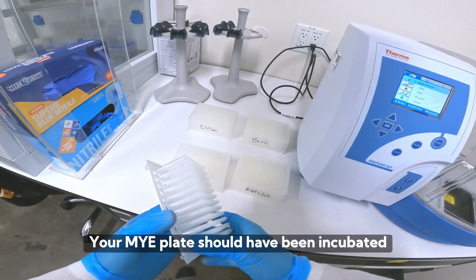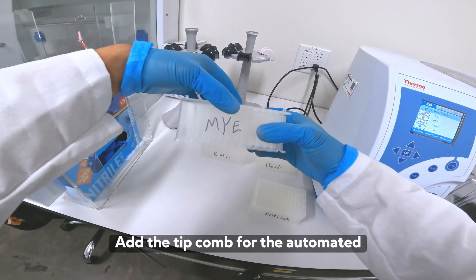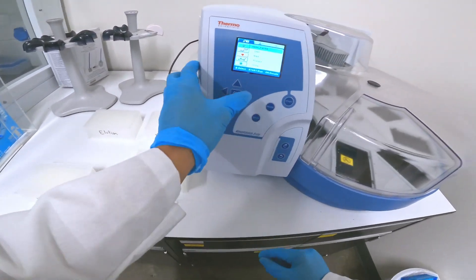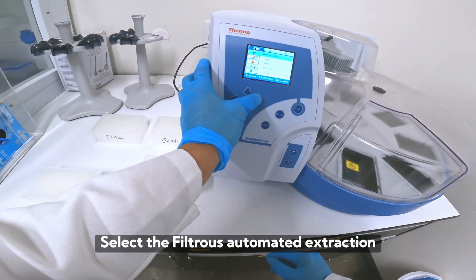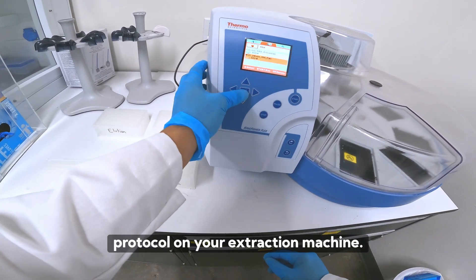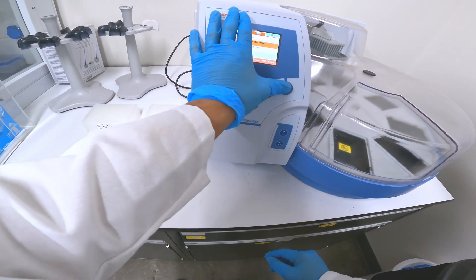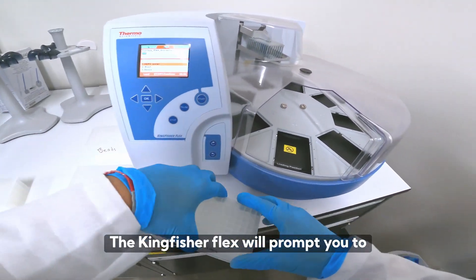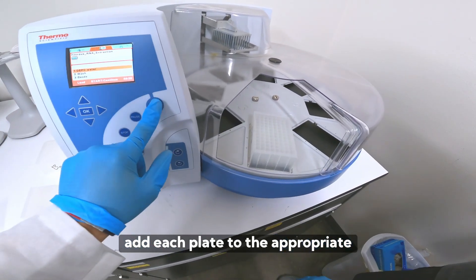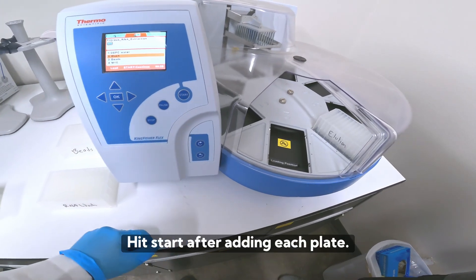Your MYE plate should have been incubated for at least 10 minutes. Add the tip comb for the automated extraction protocol, then select the Filtrous automated extraction protocol on your extraction machine. Here we're using a Kingfisher Flex. The Kingfisher Flex will prompt you to add each plate to the appropriate position on the carousel. Hit start after adding each plate.